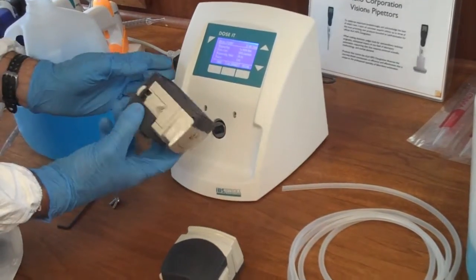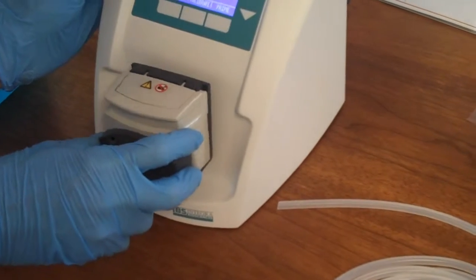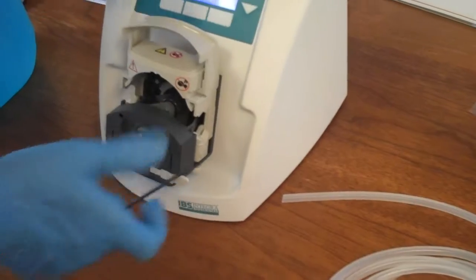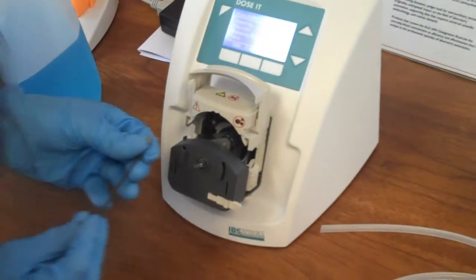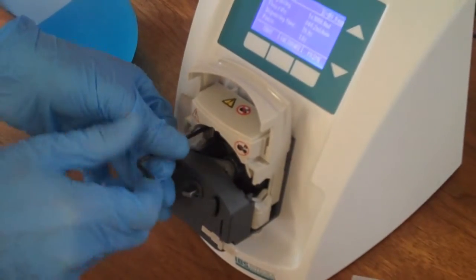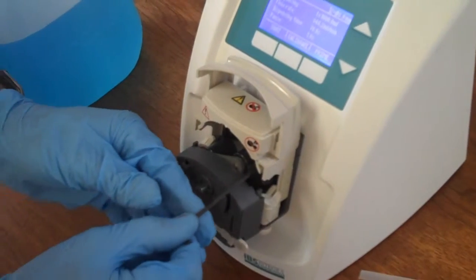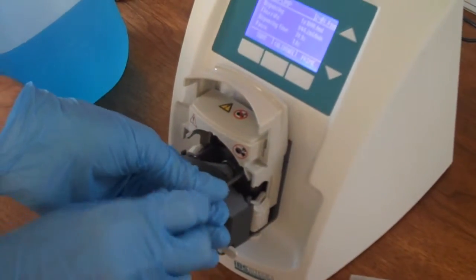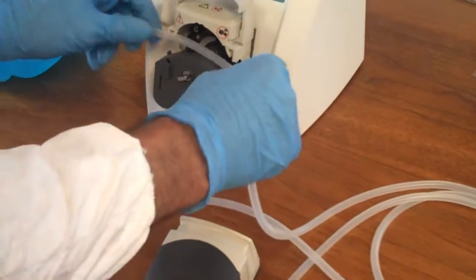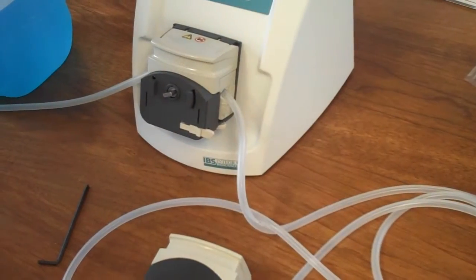We're going to use the extension pump head and connect it on here — it mounts very easily, with just two screws that hold it in place. The beauty of this design is that you can choose to run the device with a single pump head, using a single length of tubing, which is basically a very conventional peristaltic pump setup.